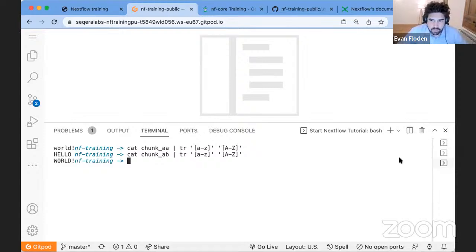And you can see it's taking it from hello to uppercase hello and lowercase world to uppercase world there. The final part of the pipeline is some Nextflow syntax around how we're going to be viewing the contents of that, which is essentially printing it to the screen itself.